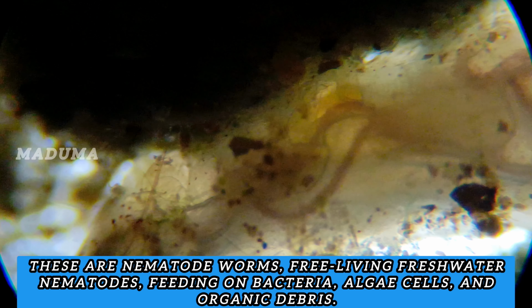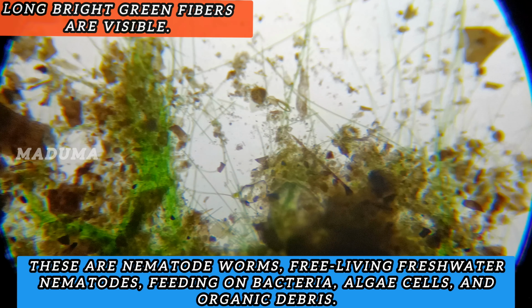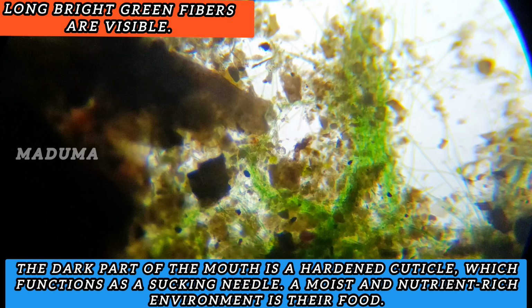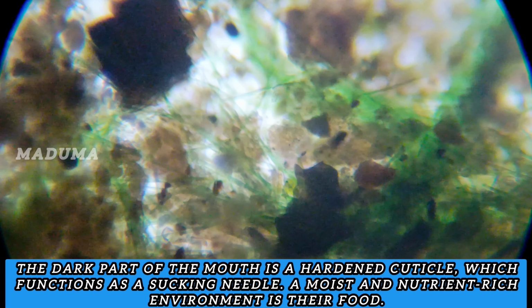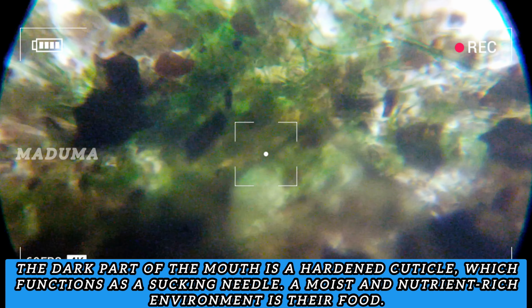These are nematode worms, free-living freshwater nematodes, feeding on bacteria, algae cells, and organic debris. The dark part of the mouth is a hardened cuticle, which functions as a sucking needle. A moist and nutrient-rich environment is their food.